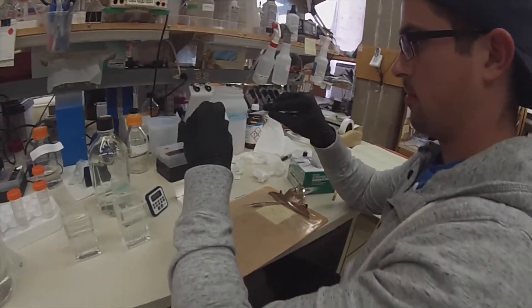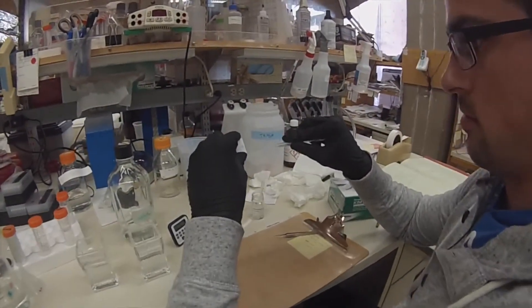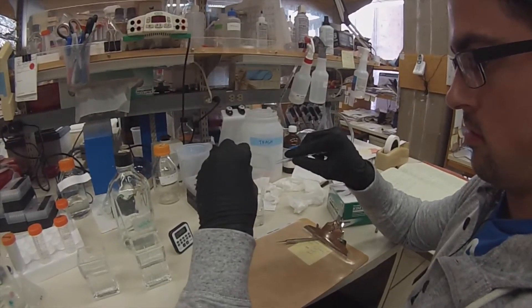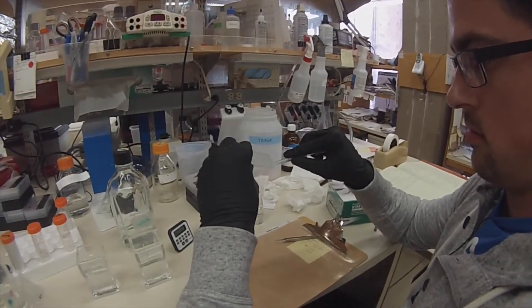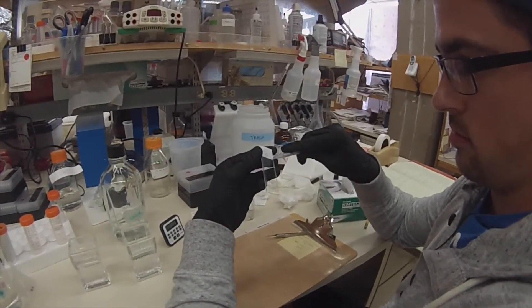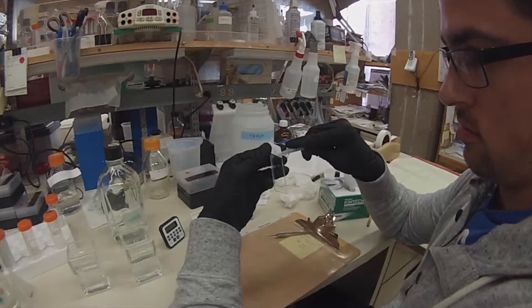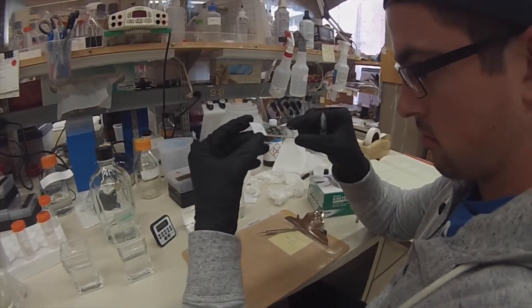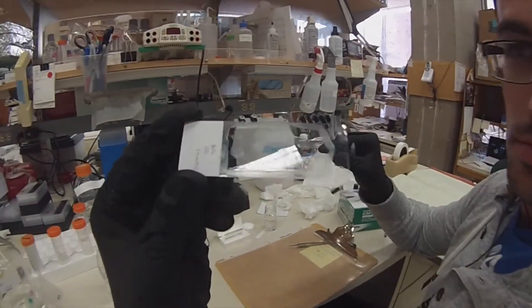This is the same thing — I'm just repeating the process. You can see I'm taking a lot of care to make sure all the liquid is off. On these slides there are six sections of thymus from two samples, so that's just enough space. The green you'll see on there is from the pap pen.